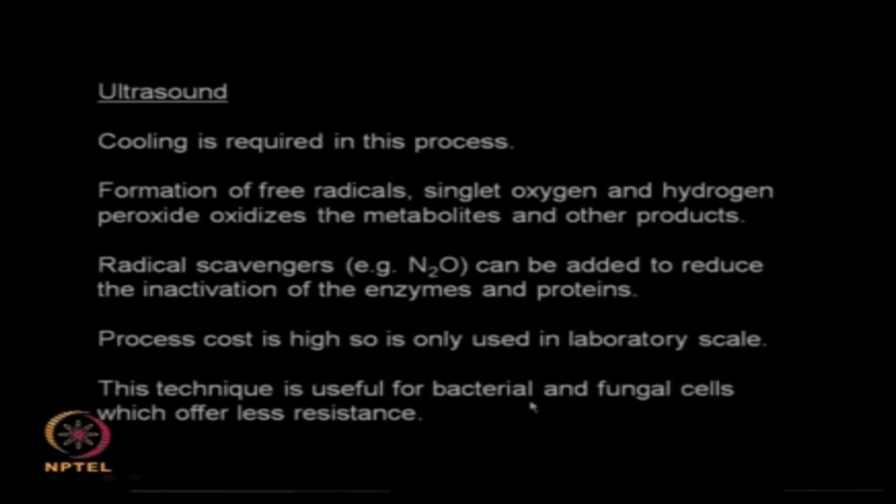And it is also good for bacterial and fungal cells, which offer less resistance. So it cannot be used for plant cells which are very tough. So it is ideal for these types of cells only.